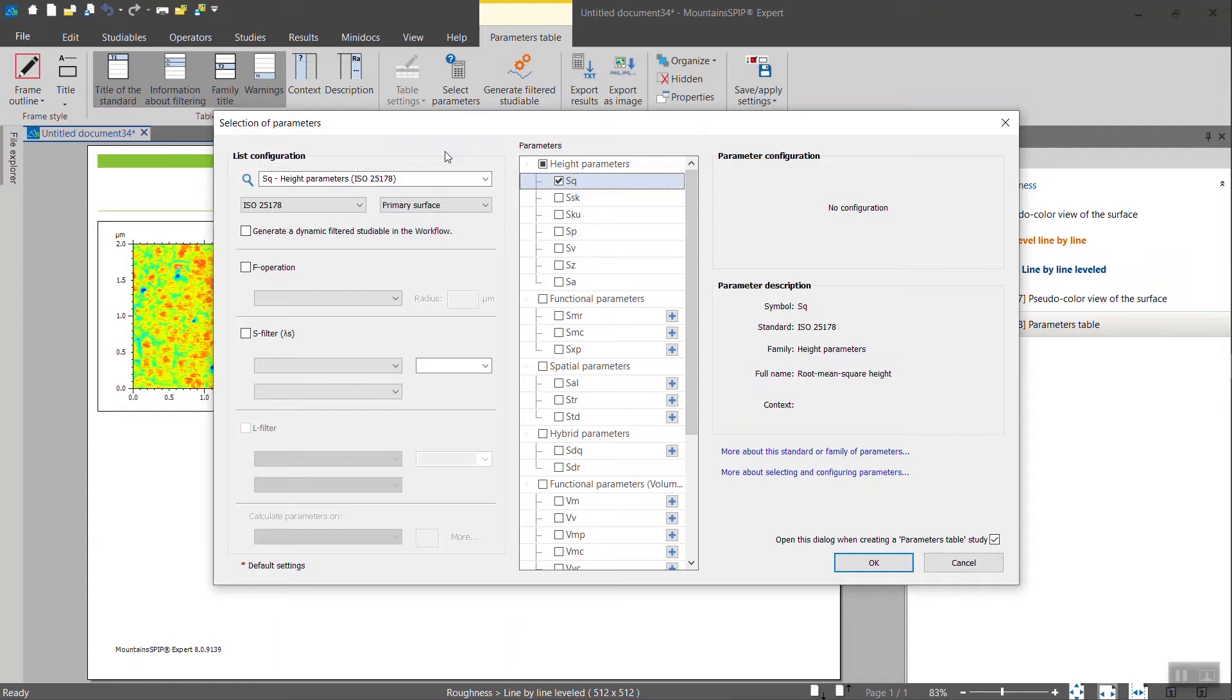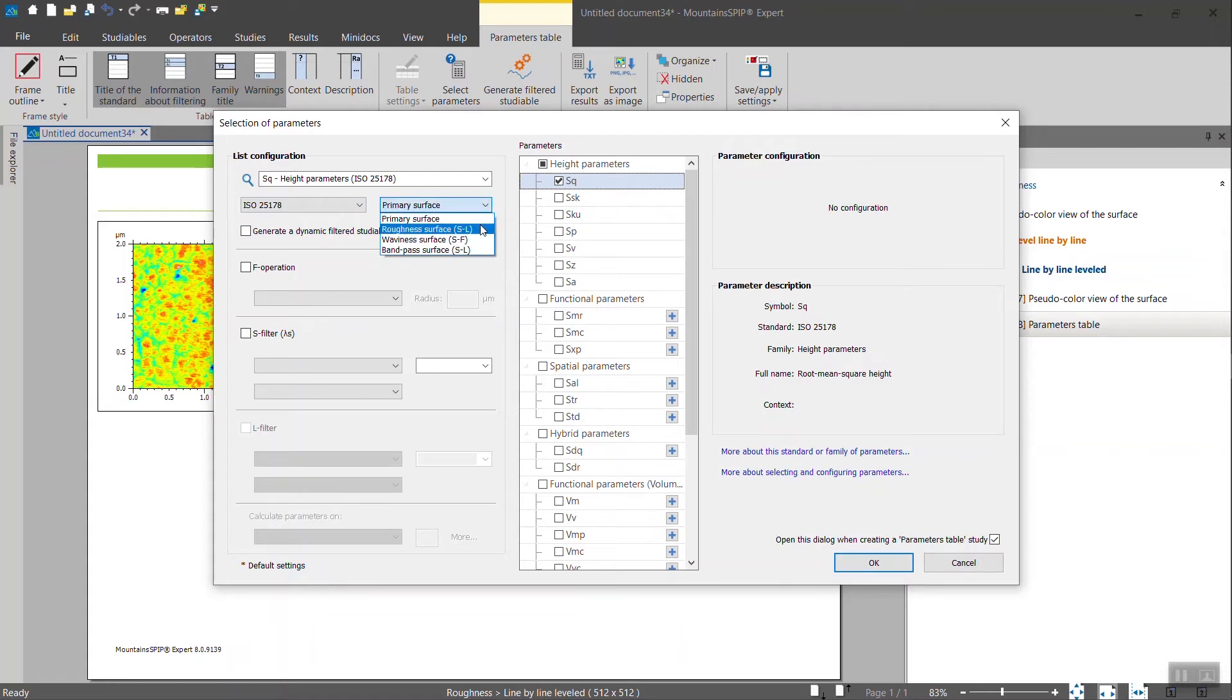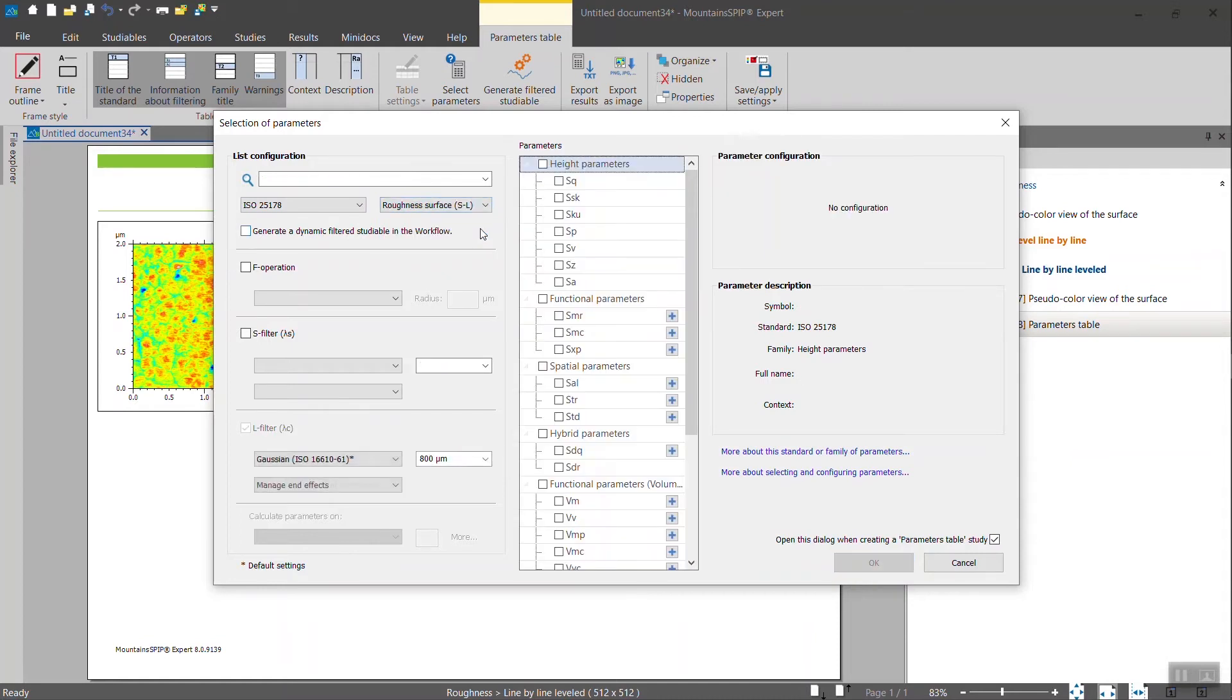Surface texture parameters are being calculated usually on filtered surface. If you want to calculate them on unfiltered surface, those are called primary surface in Mountains software. If you want to calculate it and follow closely the ISO standard, you will select roughness surface. Which means that at least a filter will be applied for separating the waviness component of the surface and the roughness component of the surface.